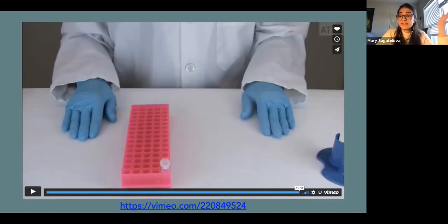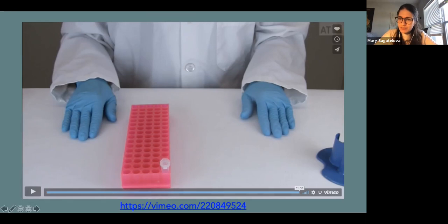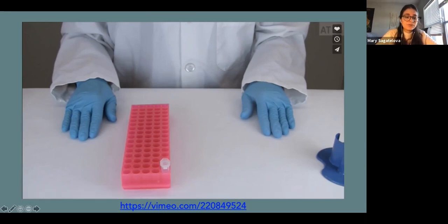So that's it. That is exactly what you guys will be doing. The only exception is you're going to be doing it with an ethanol burner on, all within an aseptic field. Okay, but the protocol is the same. The tools you're going to be using are exactly the same. So rewatch that video. I've linked it below if you want to watch it a couple times, get familiar with the protocol. But very simple.